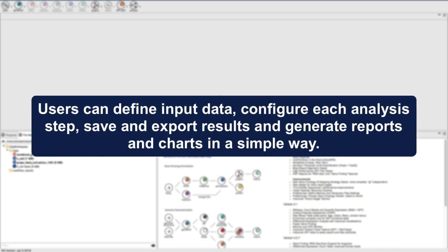Users can define input data, configure each analysis step, save and export results, and generate reports and charts in a simple way.